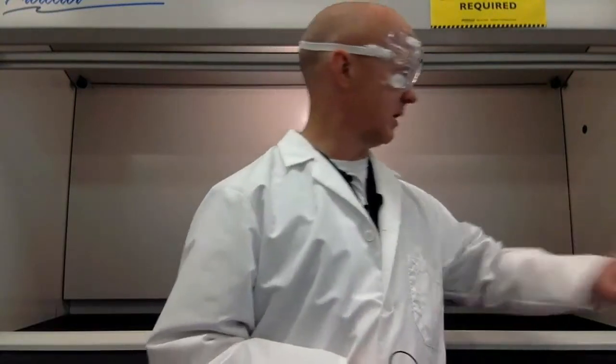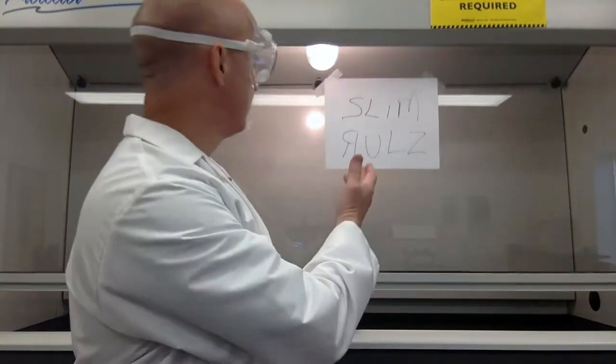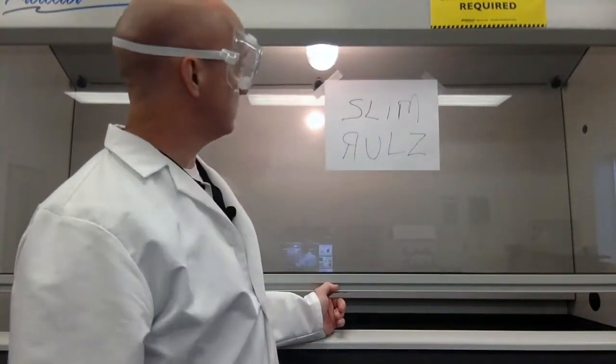This, by the way, is a fume hood. A fume hood is used if we have a reaction that produces, well, fumes. Or just noxious odors in general. To get rid of those fumes, we simply turn on the blower. The blower sucks all those noxious fumes out and away from the laboratory. Another handy feature of this fume hood is that it has this glass shield. So let's say that we have a chemical reaction and we're producing a whole lot of fumes. We can turn the blower on and then we simply... Slim!